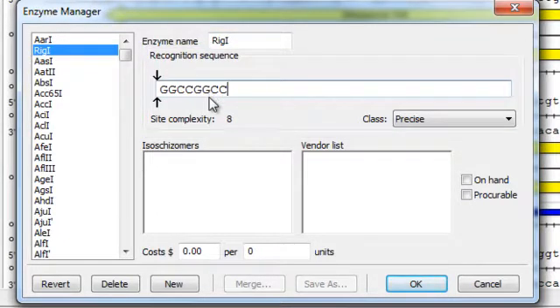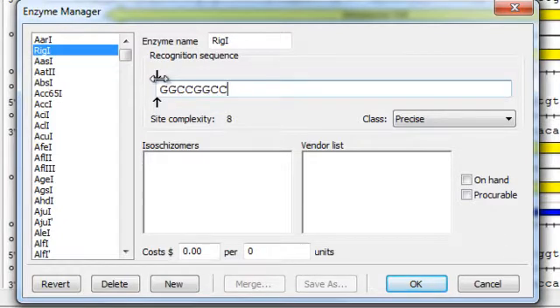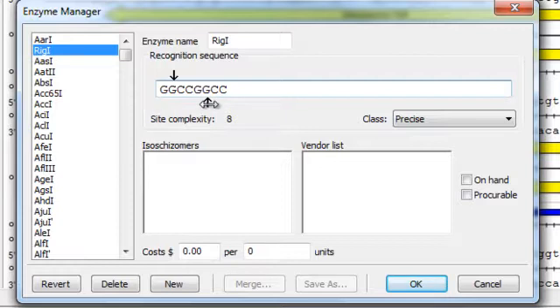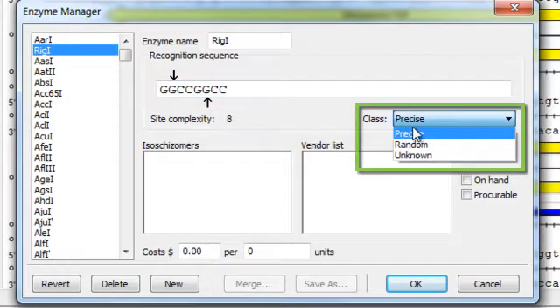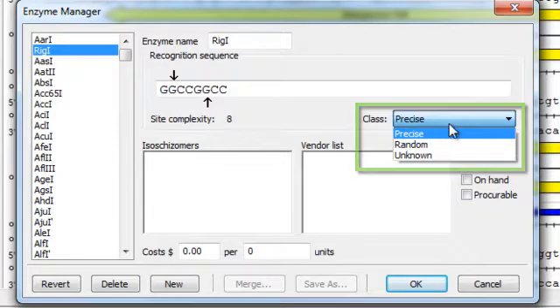If your cut site is precise, you can use these arrows to specify the top strand and bottom strand cut sites. Otherwise, select Random or Unknown from the Class menu.